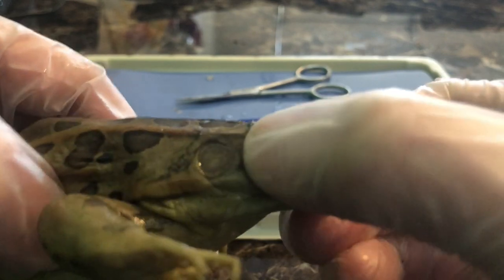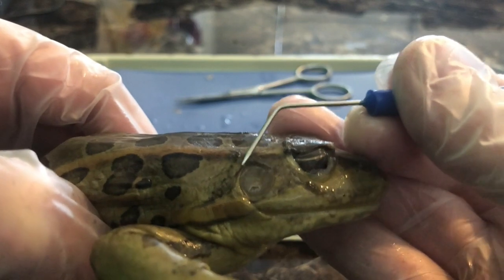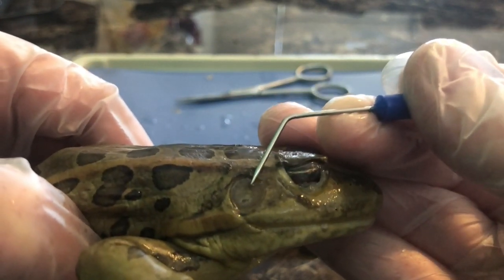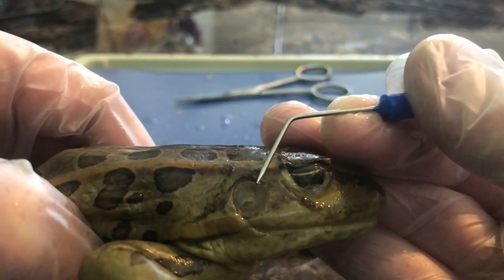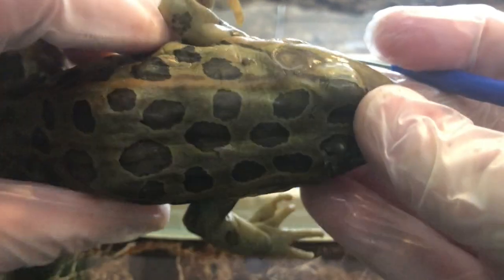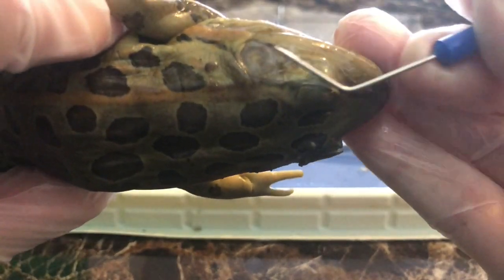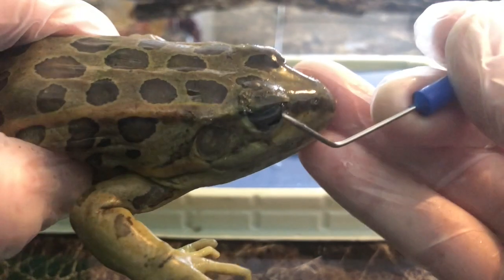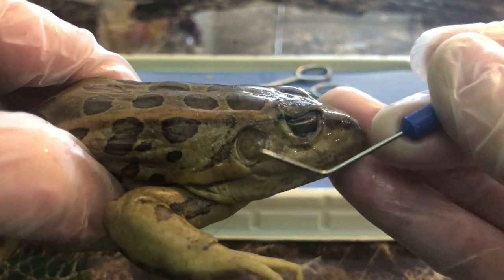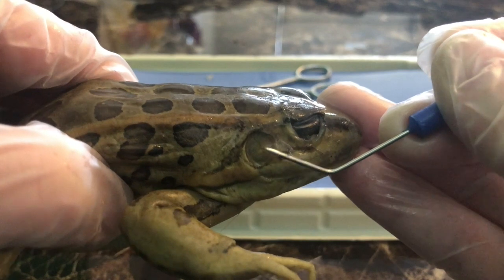Now we're going to go posterior and here we have a circular structure — we've talked about this before with the grasshopper. This is the tympanic membrane, or tympanum, commonly known as the eardrum. If I look at the frog I can clearly see the eardrum on the side — here's the eye, here's the eardrum. The tympanic membrane is used for hearing.